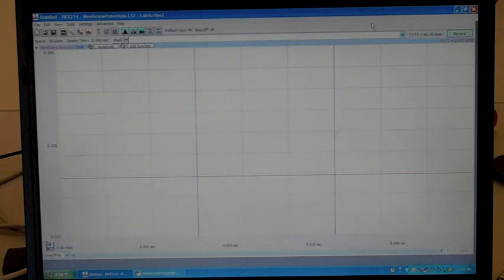Okay, so for recording, the first thing we're going to do is start this recording before you do anything, and let this record the entire time. What you are going to do is make notes as you proceed throughout your experiment about when you're starting experiments and ending them. And then you will go back with your notes to this recording after the experiments are all done and obtain your data from that recording.